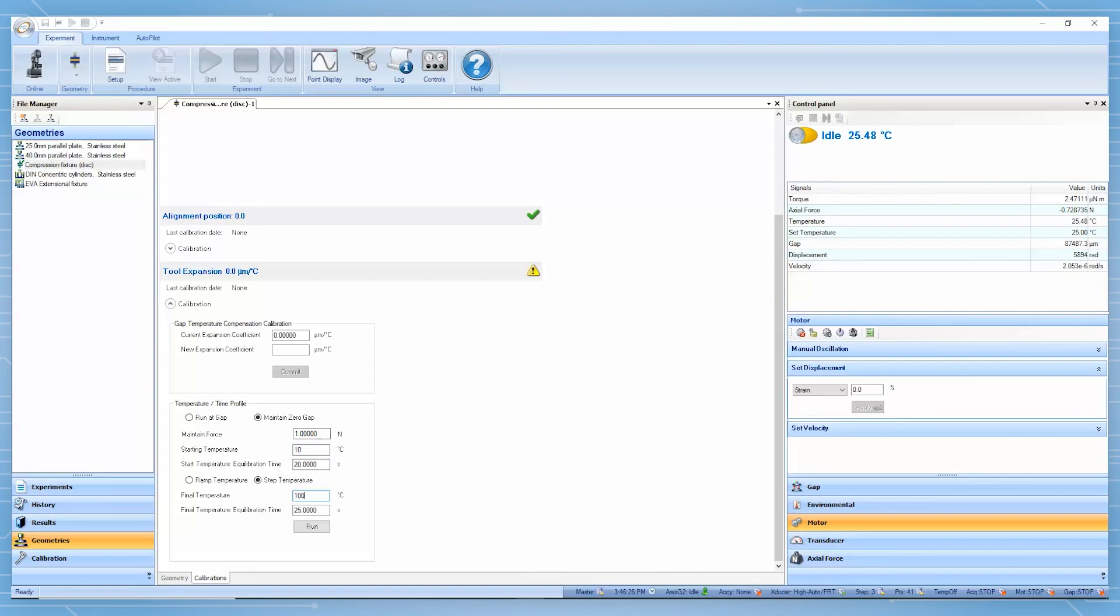However, if the compression measurement is conducted at isothermal temperature, then this calibration step is not needed.